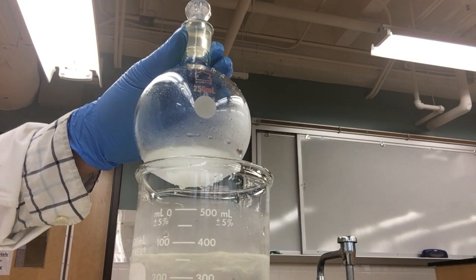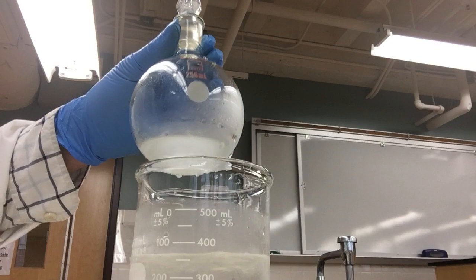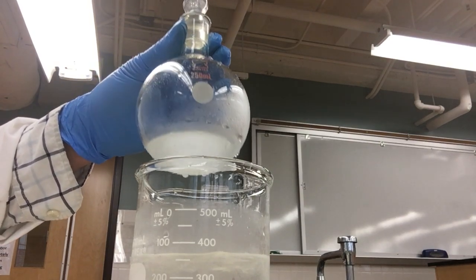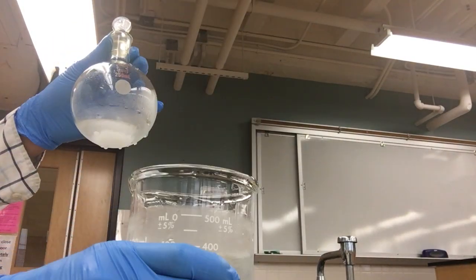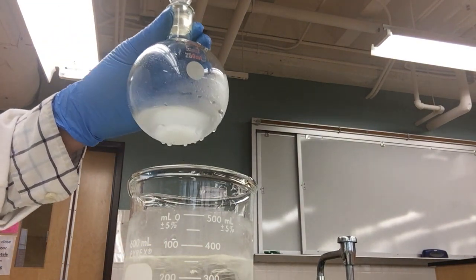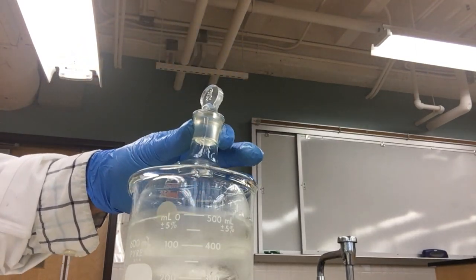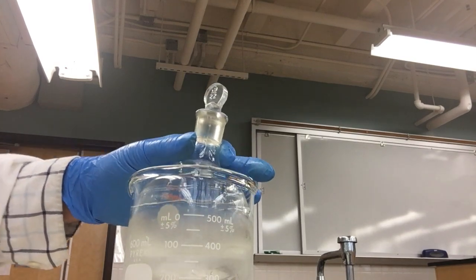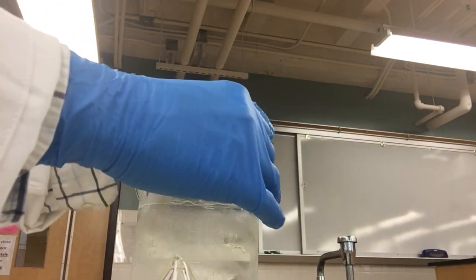The process is very exothermic, and because the heat generated could cause fumes to rise and could potentially cause the container to become very hot and you to drop it, we are going to actually do this step inside a cold water bath. The cold water bath is prepared by adding some chunks of ice to regular water, and we are going to lower our round bottom flask in it while we slowly add the acid to it using a stemless funnel. And as we add the acid, we are going to constantly stir our round bottom flask.